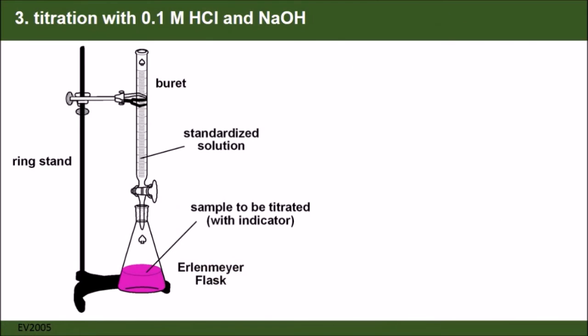So what to do with these centrifuged soil samples and water samples and filtrated materials? We want to do titration. Titration, here we see a typical setup of a titration rig. Yeah, that's a ring stand here. And then you have a burette here containing the titrator. So some standardized solution you use to drop into your sample.